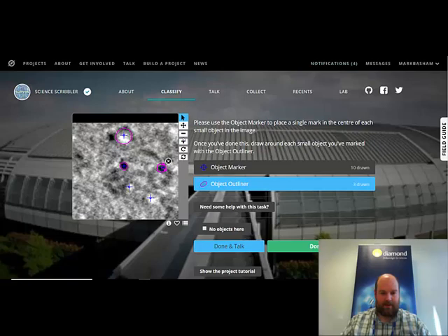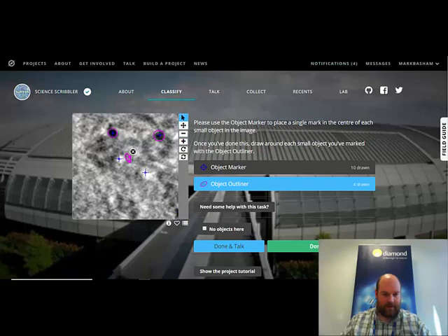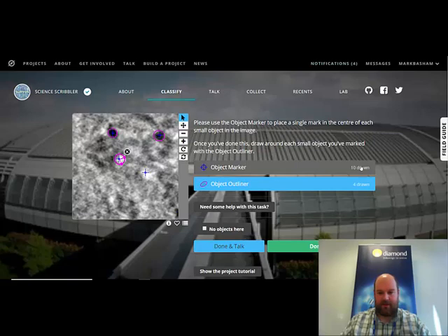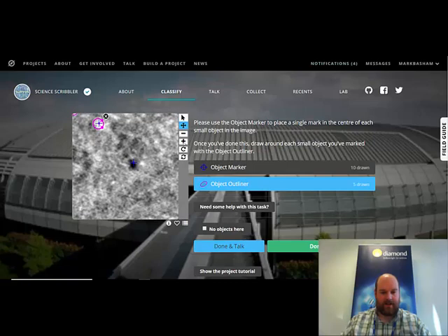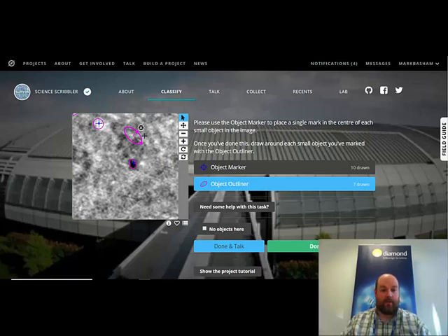But it does highlight the fact that if I'm trying to draw at the same place as one of these, I can often grab it by accident, which makes life a little bit difficult. So just use the drag handles, drop it in place. Perfect. I'm going to zoom in a little bit more. Makes life a bit easier. So let's just drop these on. And what we're trying to achieve here is basically making sure that we have the same number of object markers as we have outlines. Now, one thing I guess it's quite important to say here is that the object marks, the little crosses, don't actually need to be right in the middle of where the object is. And in fact, in a way, it's sometimes better if they're not. Because that helps us train the algorithms we want to use a little bit more easily.